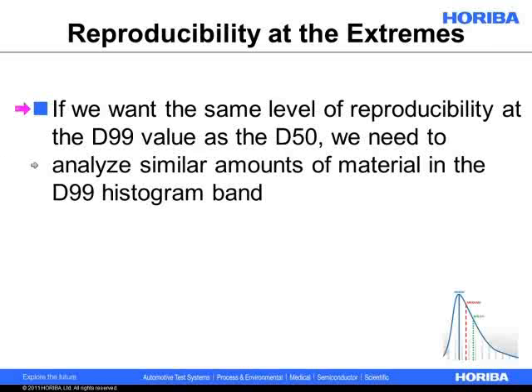And one of the key challenges here that I haven't talked about yet is sampling and dispersion. Those are the two things that you need to take care of as the user before the sample even hits the analyzer. Let's say you're starting from a powder and you're trying to reproducibly sample your largest particles. Chances are good that's going to be very difficult if you're not very careful about your sampling technique, either using a spinning riffler or a chute riffler or some technique that's not necessarily just scooping into a bottle.